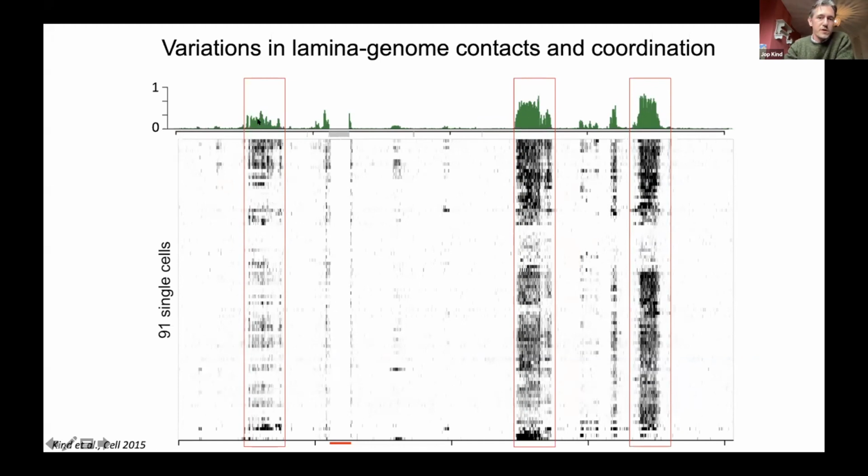Whereas here, for example, this chromosome associates with the nuclear periphery much less frequently. And also the domain structure is a bit interrupted over here. So you can imagine you can do a lot of fun things with these types of data sets. But this data has been published already a long time ago. So if you're interested in looking into that, please have a read of the paper.